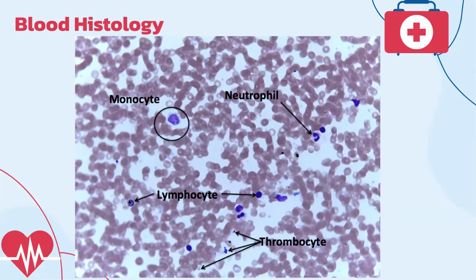Lymphocytes are typically very round, very circular, and they are going to be completely dark blue. So, unlike the neutrophil, which can have multiple nuclei within it and an irregular shaped nuclei and then a cytoplasm, the lymphocyte is just completely dark blue. You cannot see the cytoplasm very much.